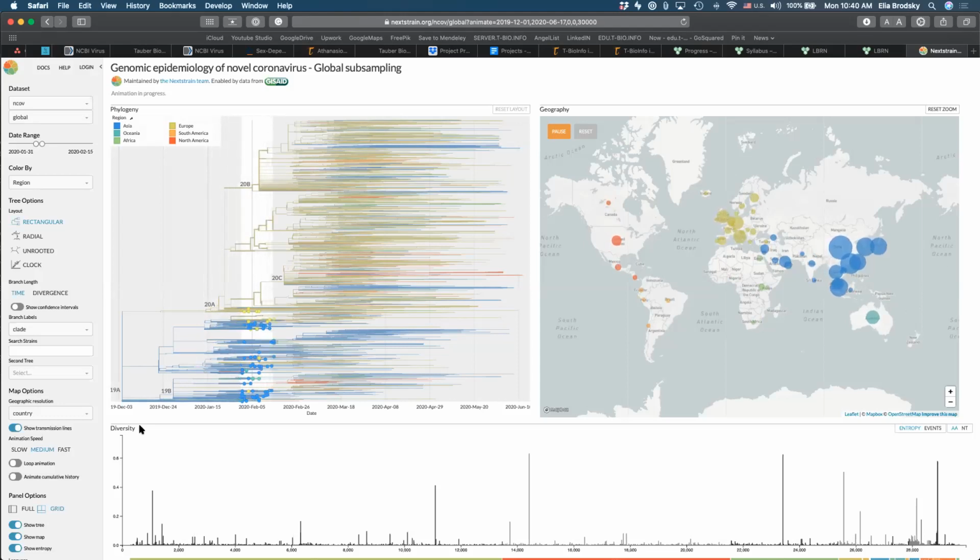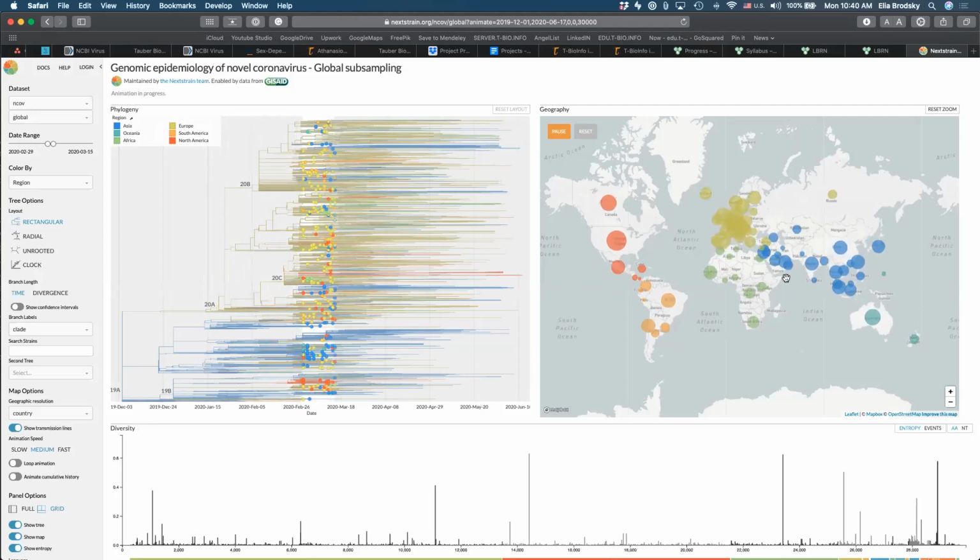So as you look through this animation and you can see how the virus spread throughout the world, you are going to start wondering, how are the different genomes in different locations different from each other, right? So up until now, we looked at how they are different in the host as opposed to the human, different animal hosts as opposed to the human. Here we are seeing how the virus mutates over time in the human population.